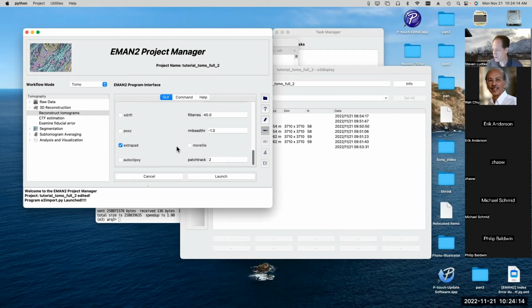So if you're looking at vesicles on the edge and you want to see the tops and bottoms of the vesicles, some of the wedge filling tools can make a significant difference for that kind of application. That's a much bigger difference than you get out of EMAN versus IMOD. But those tools take a long time to run.